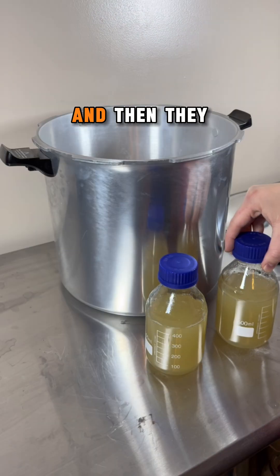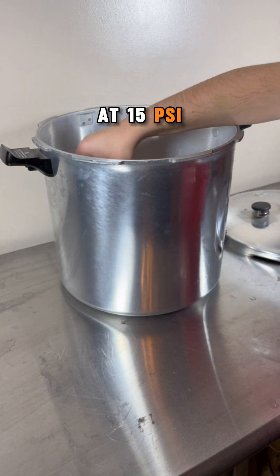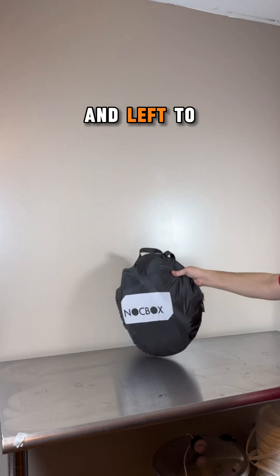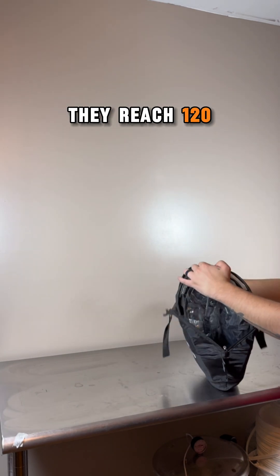The caps are twisted on but kept a quarter turn loose, and then they are pressure cooked at 15 PSI for 45 minutes. After 45 minutes in the pressure cooker, the media bottles are removed and left to cool down until they reach 120 degrees Fahrenheit.